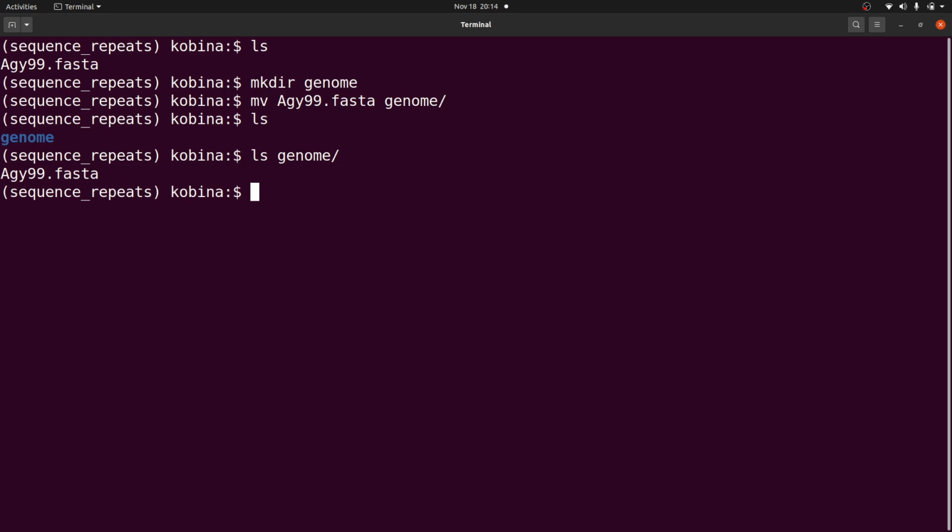Find sequences that are similar. If you have a sequence and you want to check if there's a similar sequence on the NCBI database, you can use BLAST. But you can also search for sequences locally on your PC. So that's the BLAST.